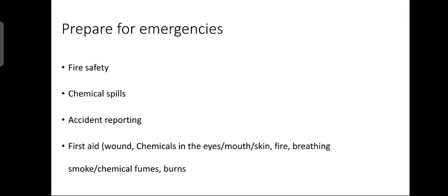If neither of these is available, irrigation with a source of high density drenching water will reduce phenol uptake, but lesser amounts of water will merely dilute the phenol and expand the area of exposure. For bromine on skin, wash with a large amount of soap and water as quickly as possible. If eyes are burning or your vision is blurred, rinse eyes with plain water for 10 to 15 minutes.